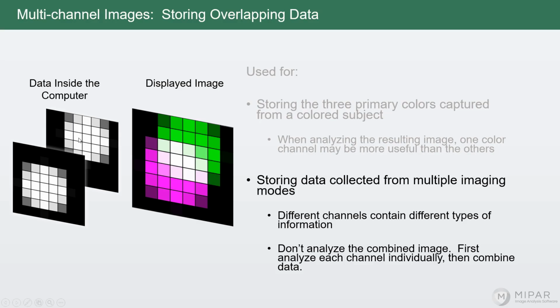So perhaps the two channels don't have the same intensity. Your two proteins aren't expressed to the same level, and so one is dimmer than the other. Then you're not going to see any white. You'll see more either pinkish or greenish. And say, for instance, that there's some texture inside one of these proteins in its distribution that doesn't affect where you consider its localization to be. That texture could then influence the displayed image.